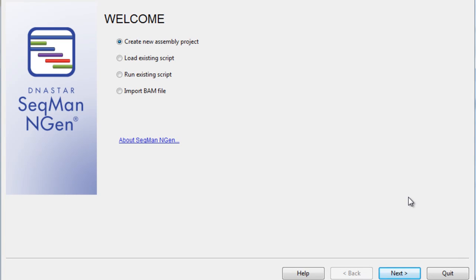The first step is to start a project in our SeqMan Engine application. SeqMan Engine is our application for NextGen Sequence Assembly. Remember, as we walk through this process, that you can select the Help icon on any screen for more information.